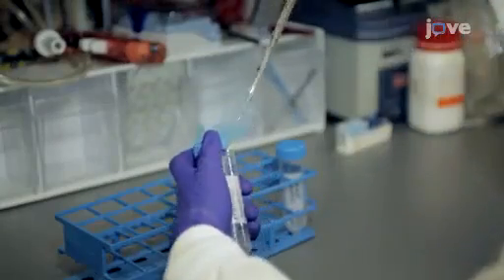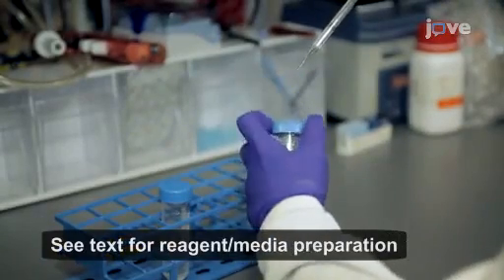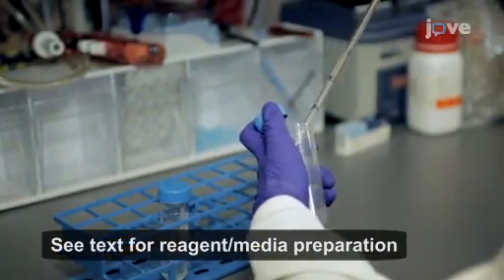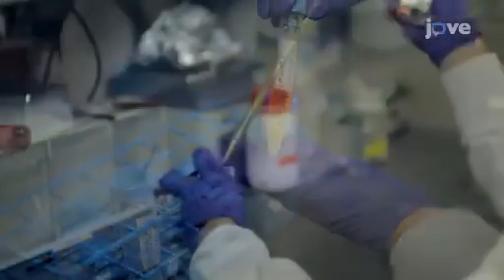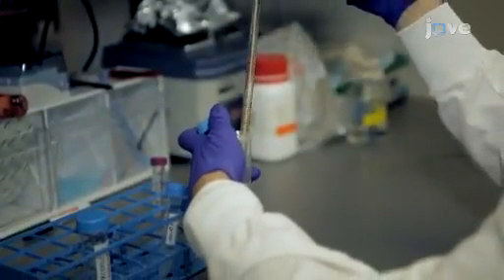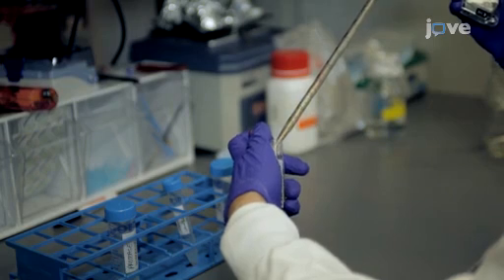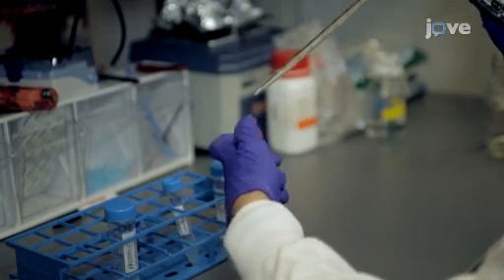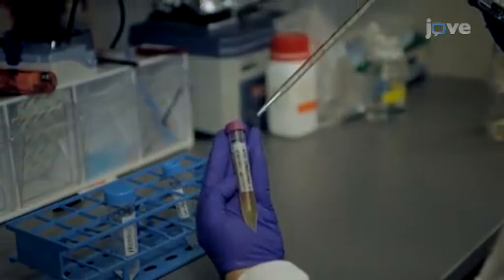Prior to urine collection, add 3.125 mL of freshly prepared protease inhibitor cocktail to an empty sterile receptacle, and then collect approximately 10 mL of first-void urine in the receptacle. Transfer the sample into 15 mL conical tubes. Please note, a 24-hour urine sample can also be used for exosome isolation by storing at 4 degrees Celsius.